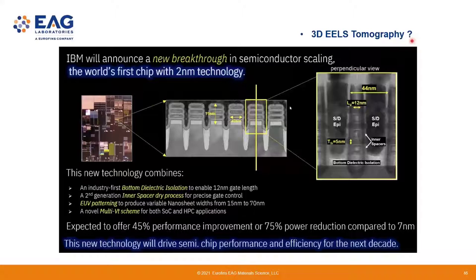If you look into the literature, there are a lot of publications from academia, really about very robust materials or ceramics most of the time. But for semiconductor devices, you really need to think about controlling the dosage, right? So from that perspective, I think a grand challenge for Gatan is to probably detect 100% of the electrons with extremely fast readout. And then, of course, we also need to worry about the workflow. For industry, we cannot afford to deliver data with a one-month turnaround time, right? That is something you don't want to do.